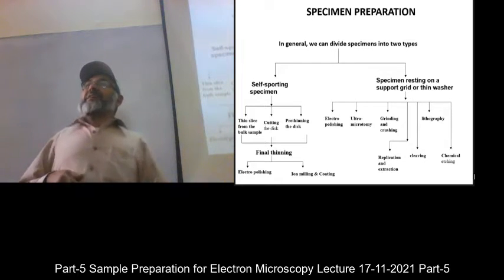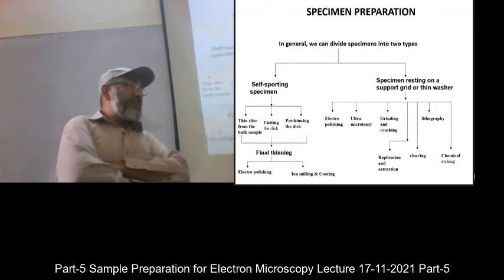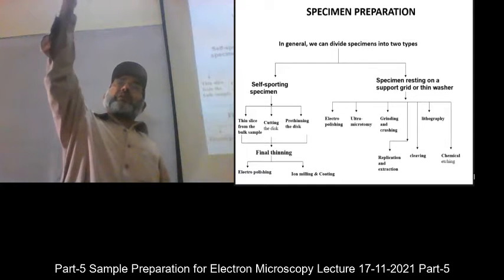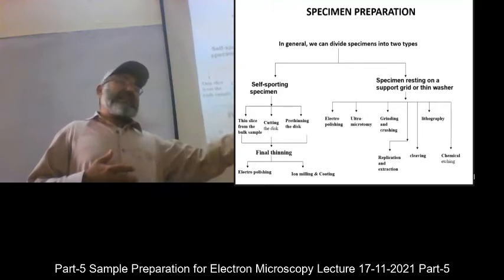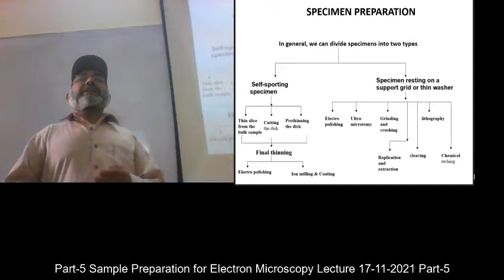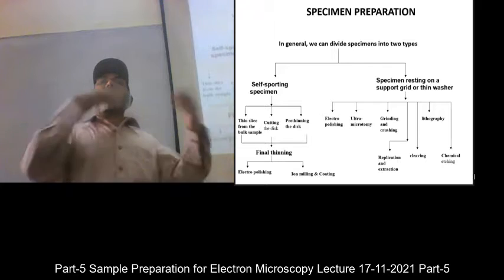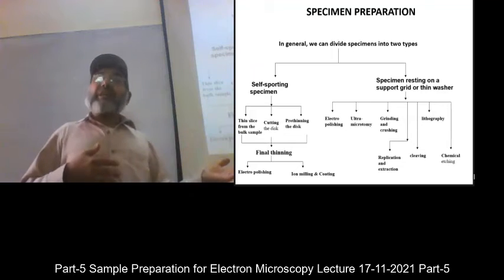If you see that this room is made of potassium or sodium aluminosilicate, this is a wrong statement. But if you say that I took a sample from that part of the wall, I took one from the ceiling, one from this wall, and the machine found this phase in this area, this phase in this area, and this phase in this area, this means that the room contains these phases. And if another person comes and selects a sample from anywhere else, then he or she may tell something else.